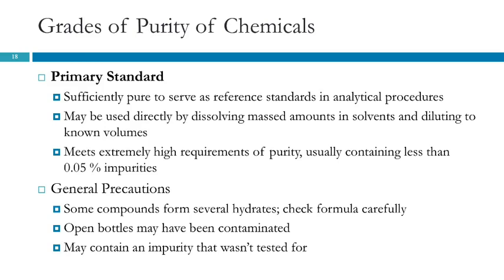I wanted to get a picture of this, but I didn't end up having time. When you look at the specifications that come with the reagent analyzed to the primary standard, it will give you what the manufacturer has analyzed as the percent purity. And so you can end up with something that's like 100.2% of your reagent.